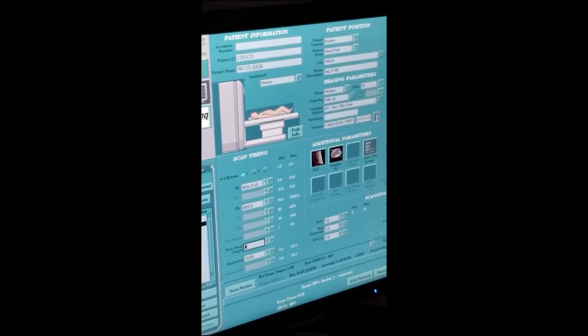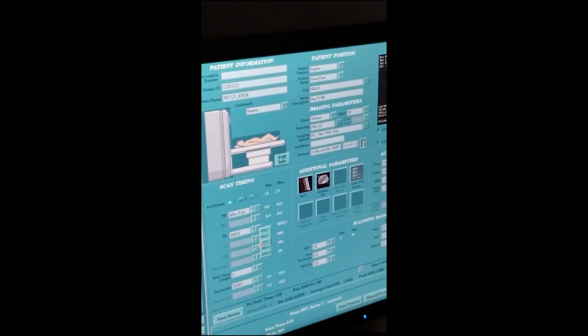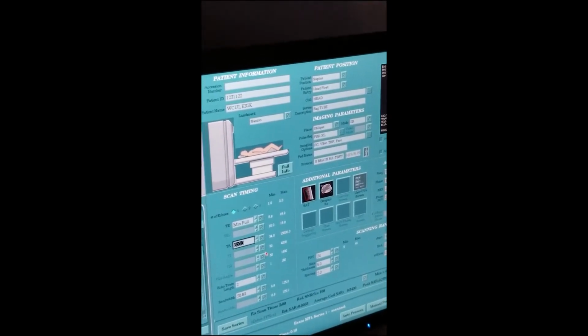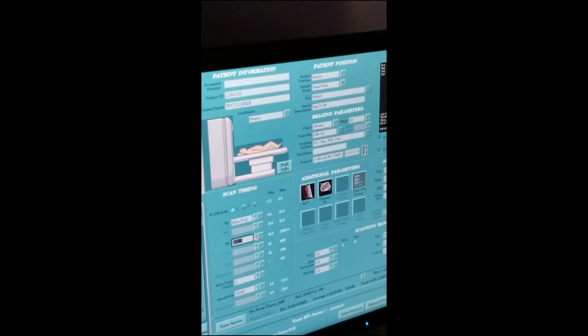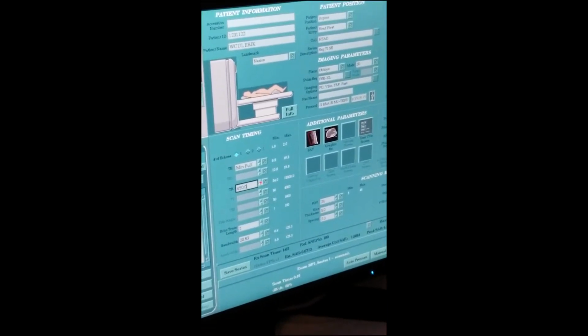This is very good. Just click down. Now it's too short, so go back up. Maybe 675. Click one more. That's it. There you go.